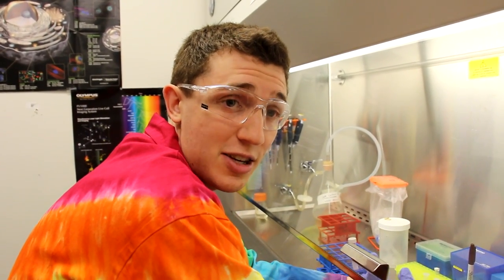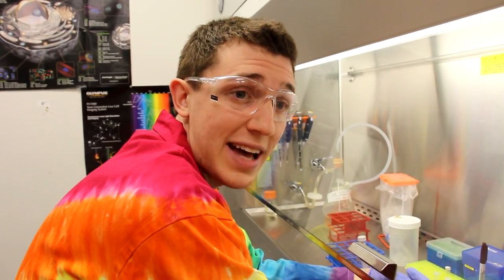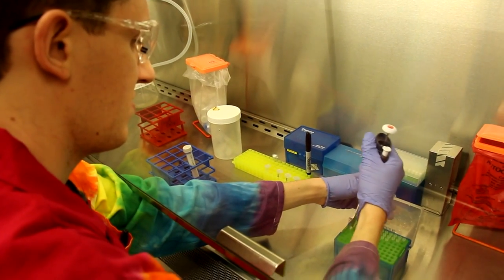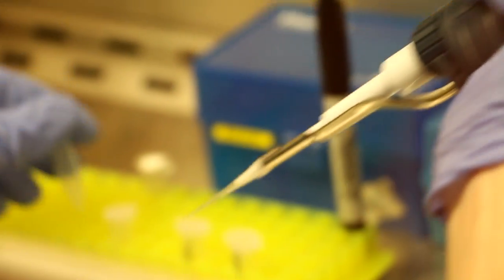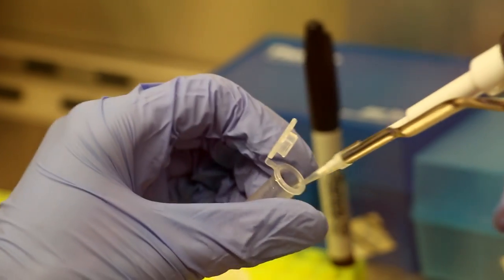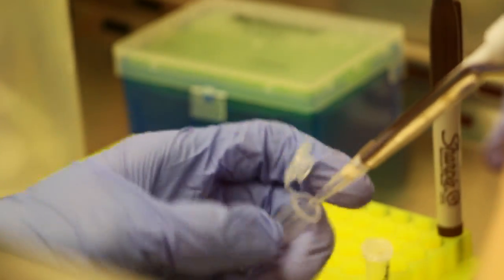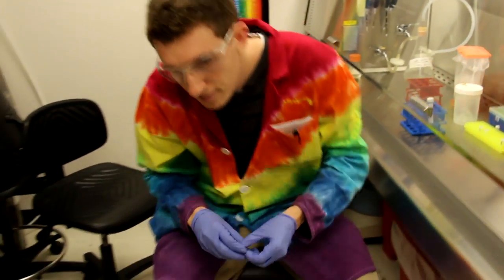First, we're going to mix Fujin reagent with DNA and then incubate it for 5 minutes before adding it to our growth media to apply to the cells. To do this, we will first add DNA to the transfection media and then Fujin reagent. Vortex briefly and then incubate for 5 minutes.